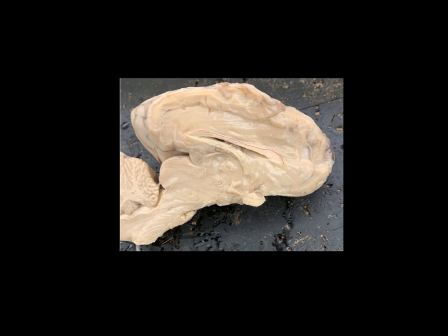Just above the superior colliculus is a small structure that tends to be a little bit darker — that's called the pineal body. The pineal body seems to be kind of light sensitive, and some people call it the third eye. But really, the pineal body is where melatonin is made, which regulates our sleep cycles and kind of day-night differences. Going down a little bit lower, we see the superior colliculus, and if we go down and forward from that, this is the pons that we saw earlier. This is the medulla oblongata, and then going off through the edge of the slide is the spinal cord.